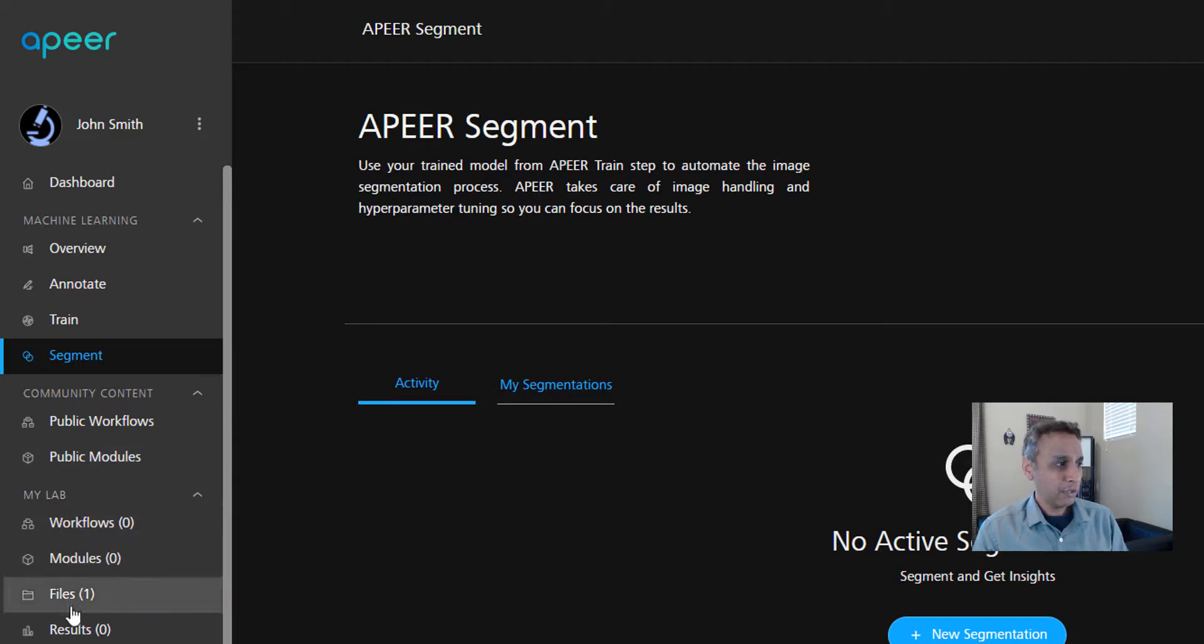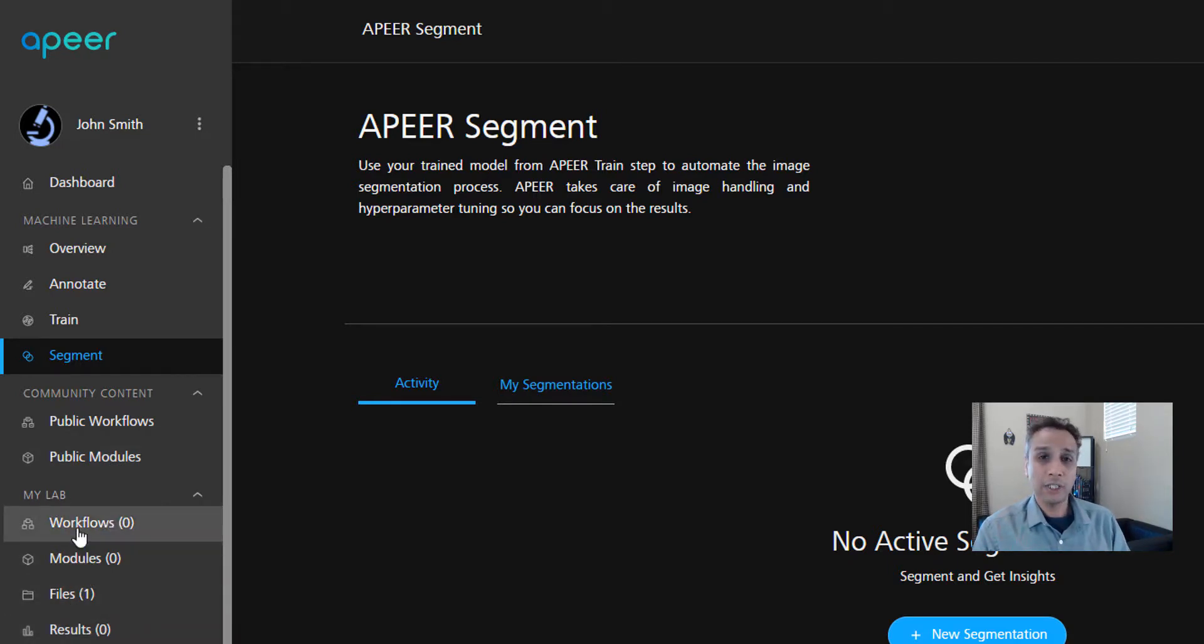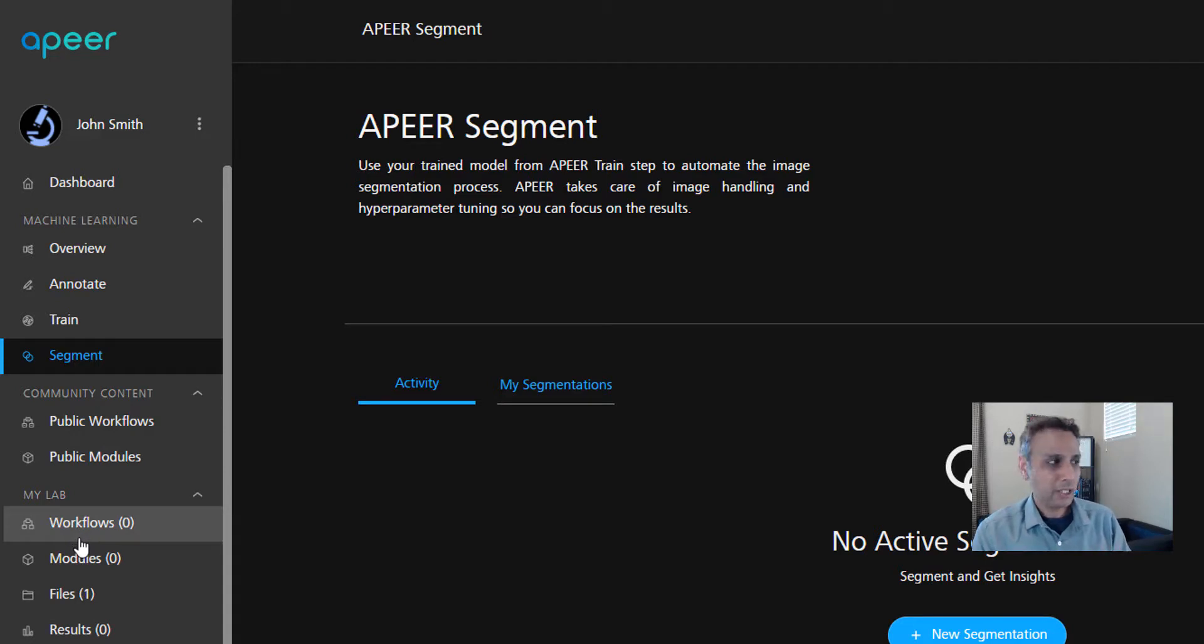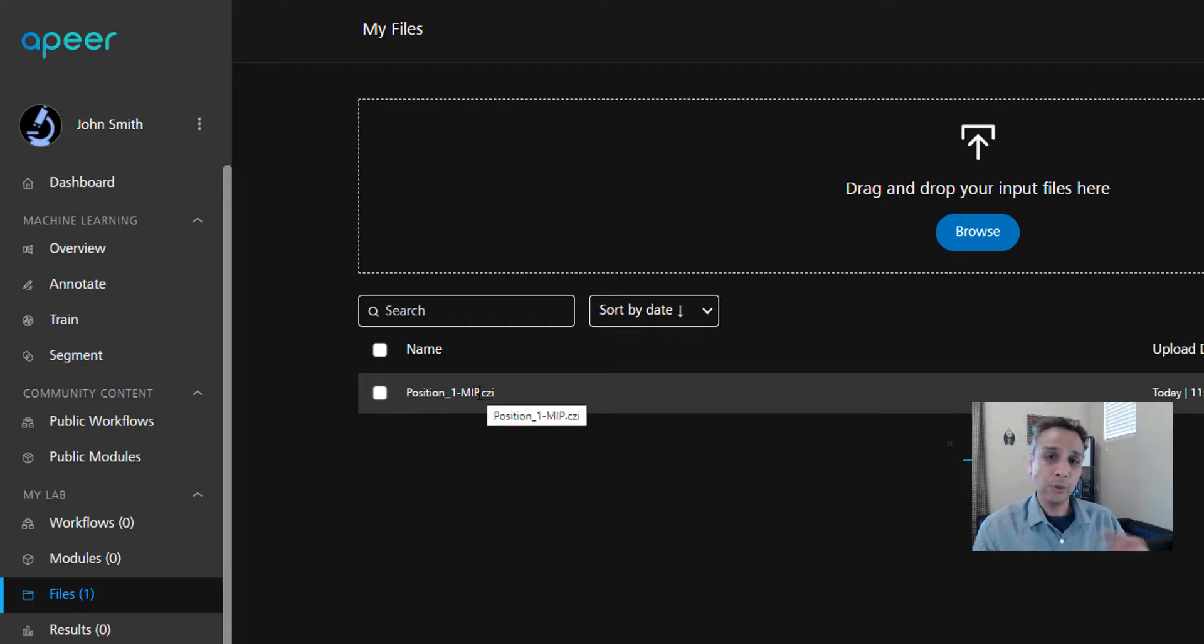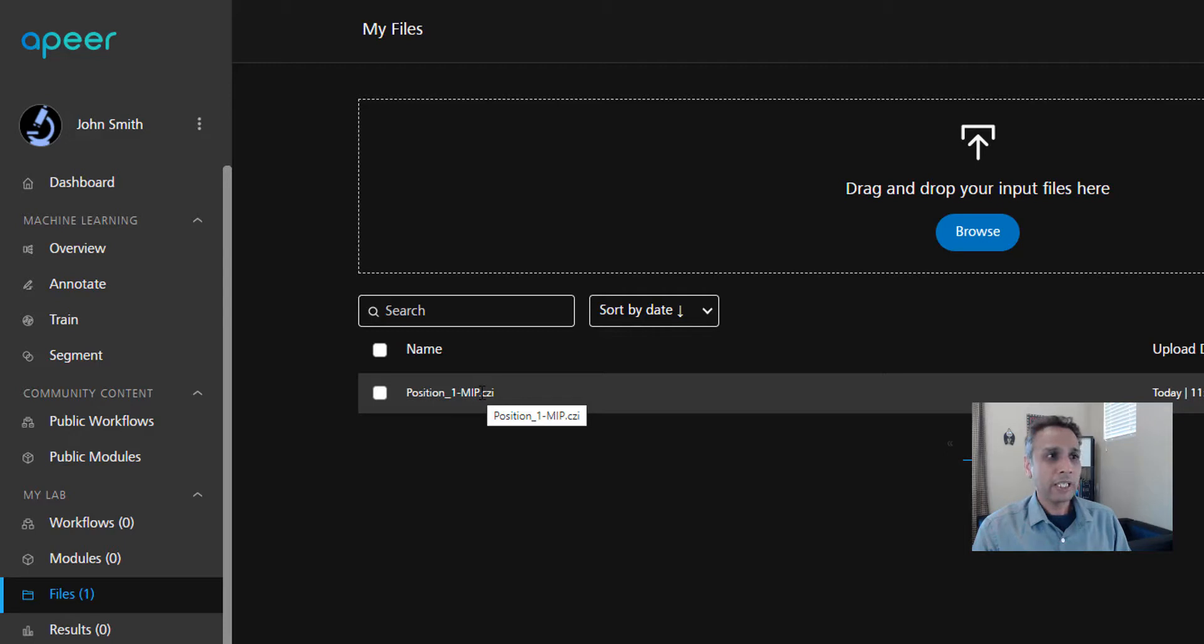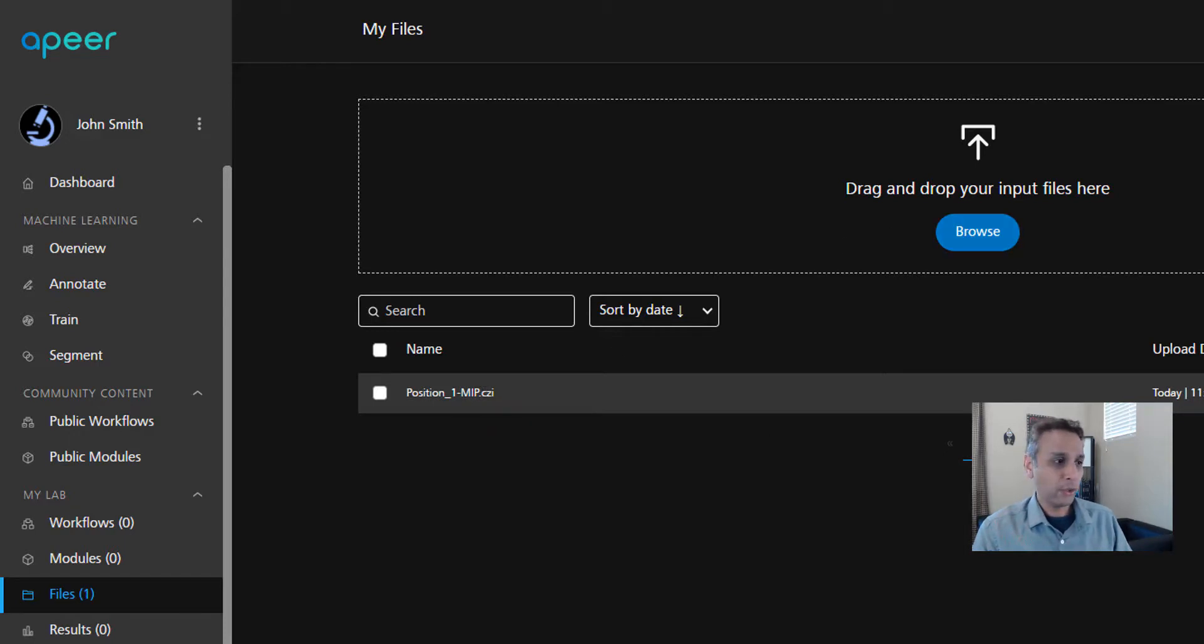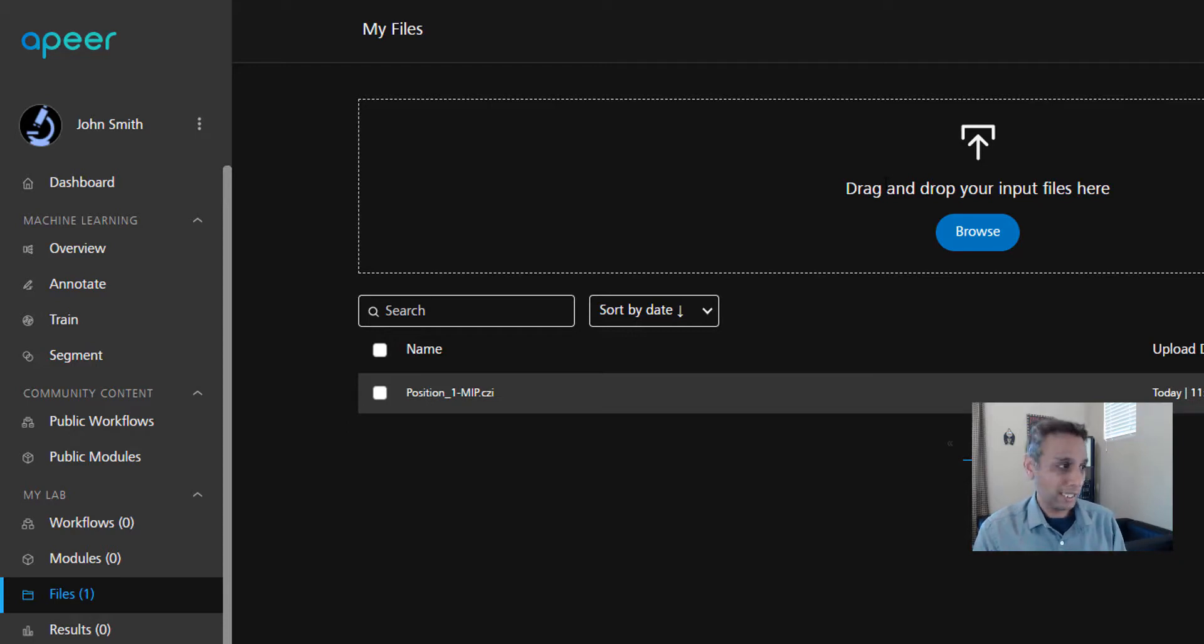It walks you through the process of annotating your datasets, training, and then segmenting using the trained model. On the left-hand side, we also have community content that shows you public workflows and public modules that everyone can see. If you keep going further down, you see My Lab where all the content is visible only to you, and this is where you can upload your own files.